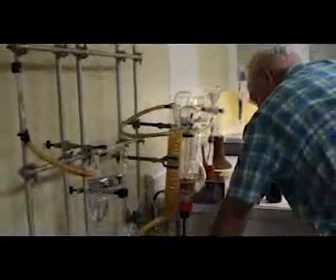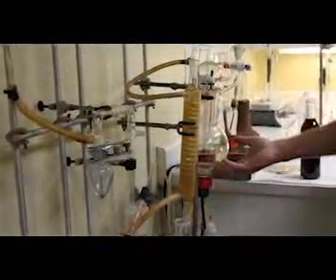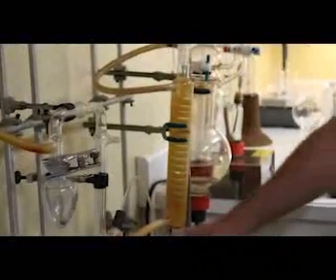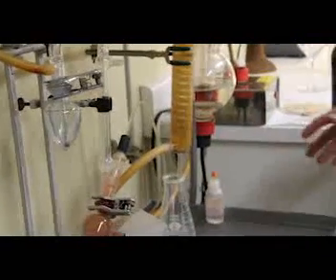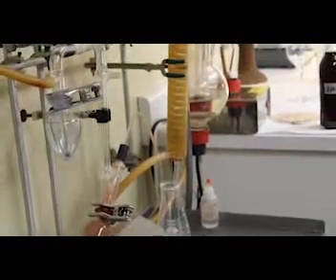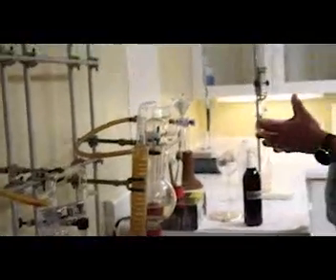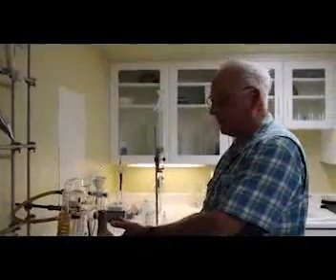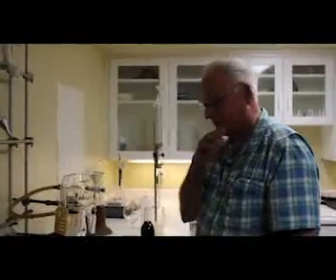So now we're going to turn on the heating element, and the heating element's going to heat this up and boil this sample, and you'll see it condense and go into this Erlenmeyer flask. We're going to want about a 100 ml sample. It could be anywhere between 75 and 150, because the rest of it will just be liquid. The amount of VA we're going to take out of this 10 milliliter sample doesn't matter how big of a sample of solution that it's in.